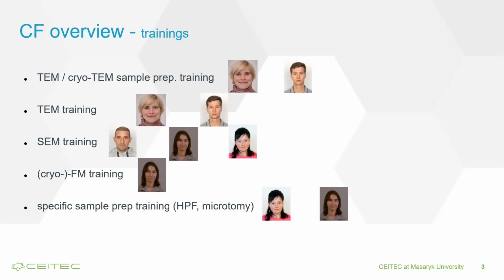If you're more interested in focused ion beam imaging or scanning electron microscopy, it will be Radka, Jana, or Pavel whom you will meet for the training. We also do a little bit of light microscopy. We have one wide-field light microscope that is operated under cryo conditions, so we can image our specimens at liquid nitrogen temperatures. If you need training for that, Jana will be the main person.